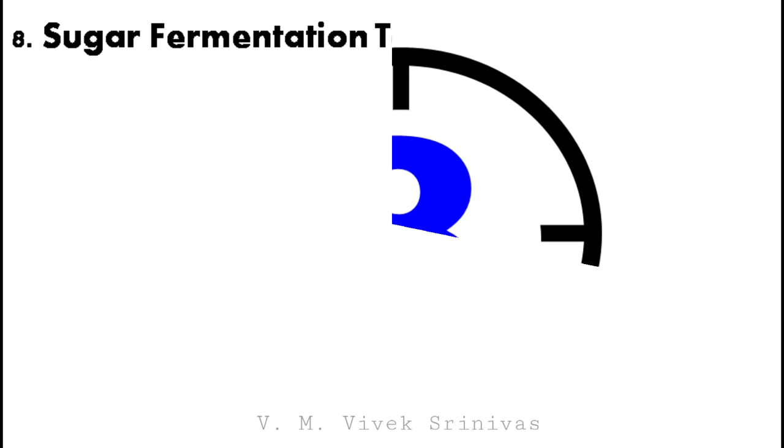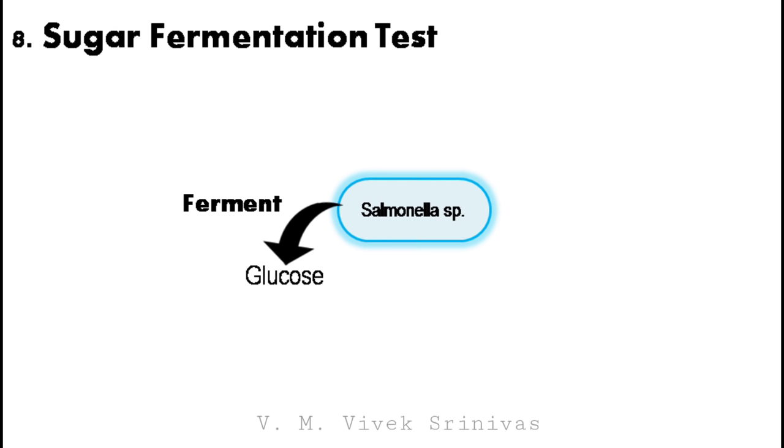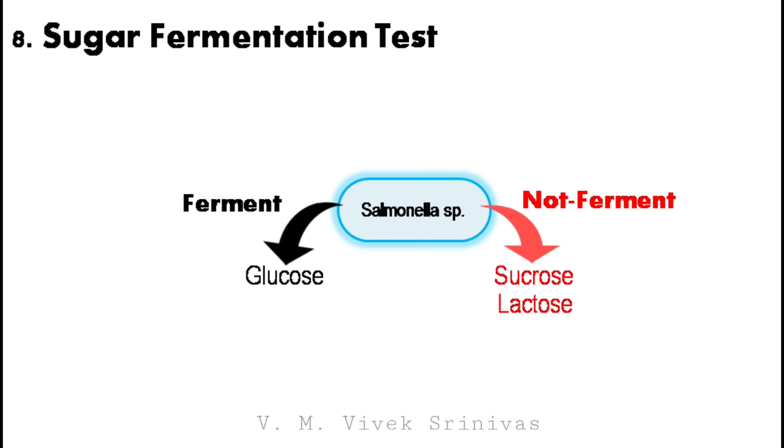Next, the sugar fermentation test. Each bacteria has the ability to ferment certain sugars and not ferment certain sugars. To find out the sugar fermentation of the particular bacteria, this test is done.